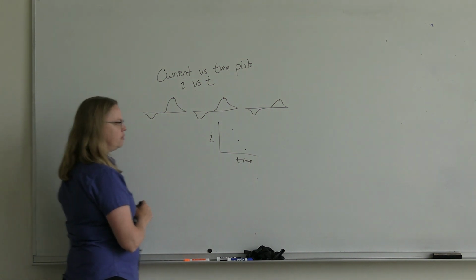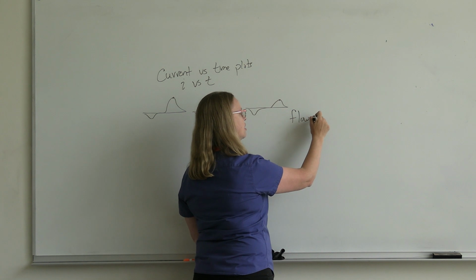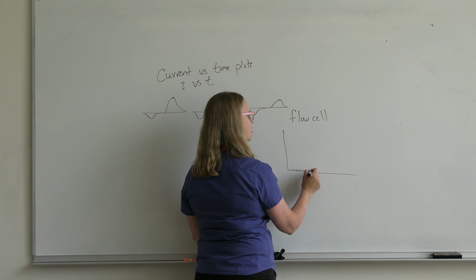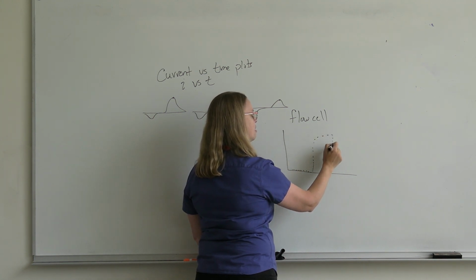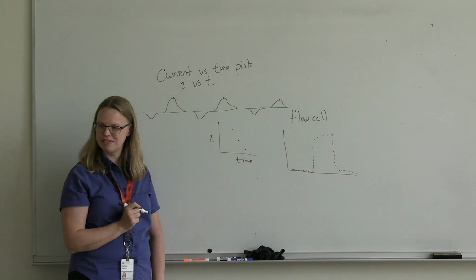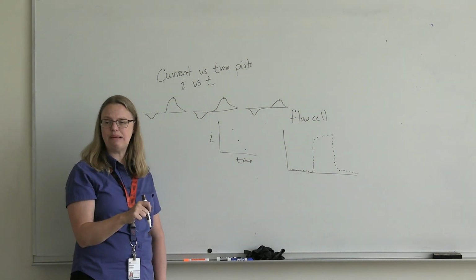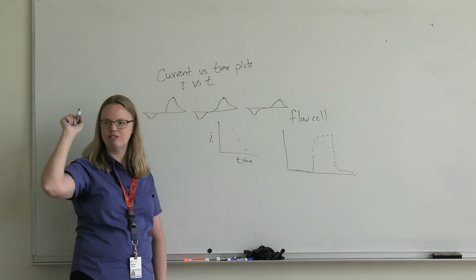So what we normally do in our experiments, let's say we're doing a flow cell experiment where we inject a plug of dopamine. Typically we're going to get nothing, and then it's going to go up, and look like this, and then it's going to come back down, and it often doesn't come back down to baseline. I drew the baseline as points on purpose because this is a sampling. I'm taking a point every 100 milliseconds, right? This is 10 hertz sampling.